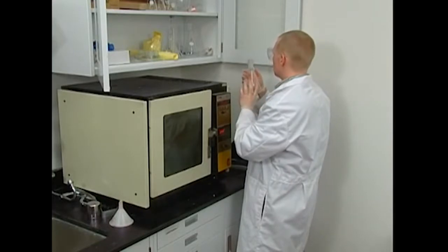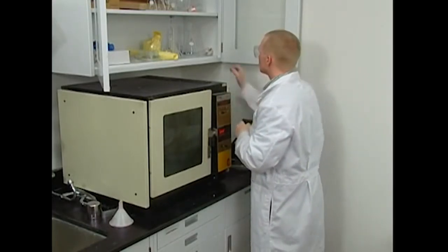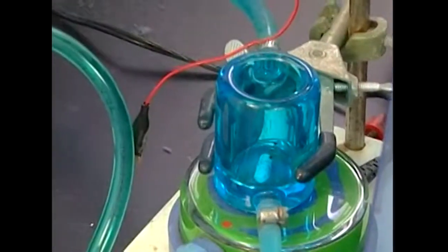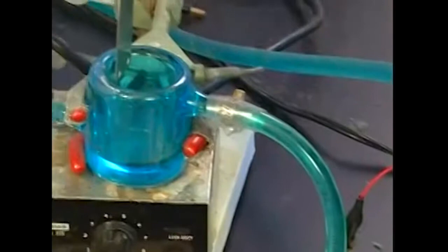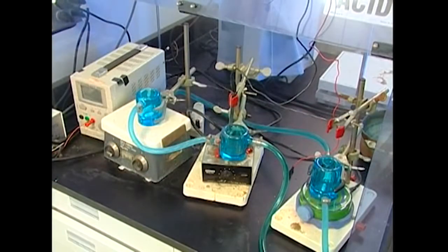We use it and follow proper procedures when we work with it. Each piece of laboratory glassware is made for a specific purpose, and it's important that we use it only for that purpose.